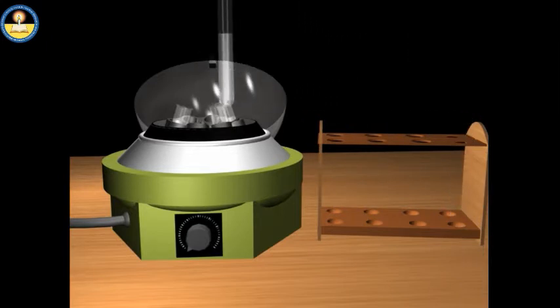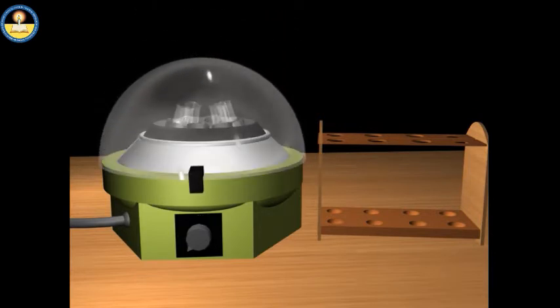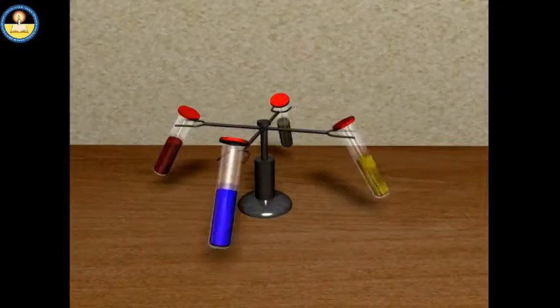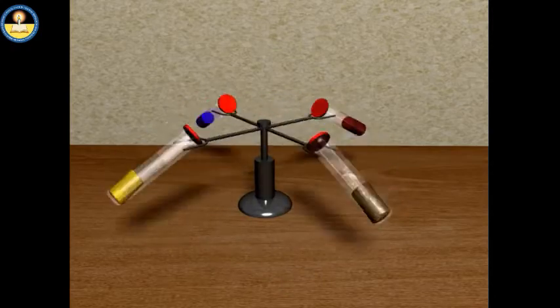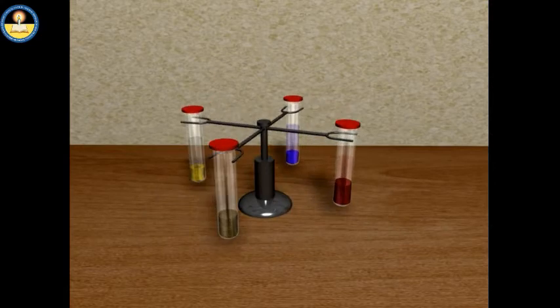Let us perform an activity to understand centrifugation. For this, we take 4 different test tubes containing blood, muddy water, calcium sulfide, and ink. When these are centrifuged at 500 RPM, we find that both centrifugal force and gravity act on them. When the machine is stopped, we observe that the solid portion has separated from the solvent.